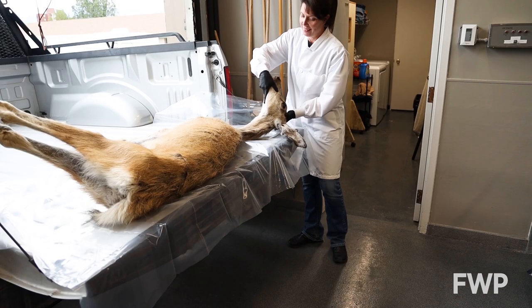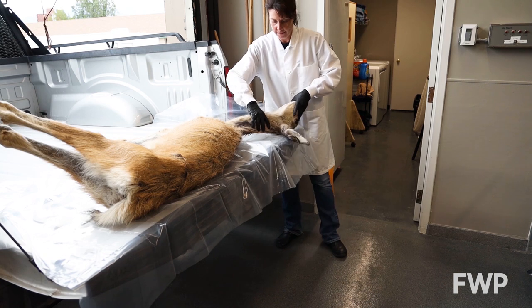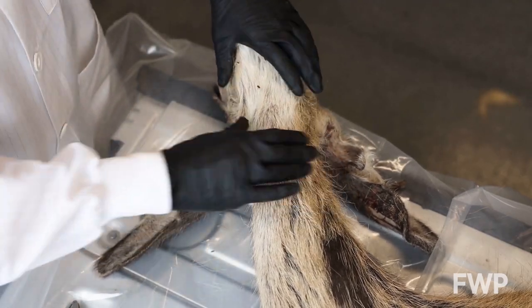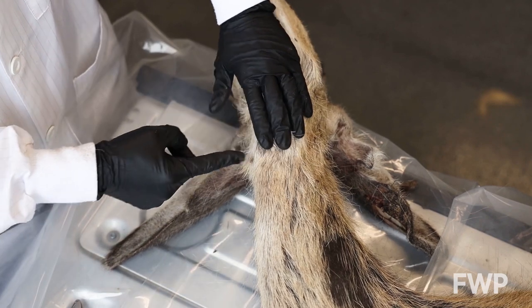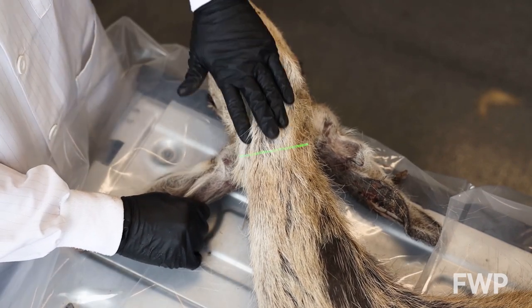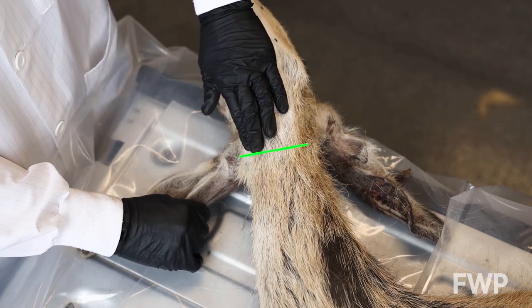Begin by positioning the animal with the head and neck upside down on a tailgate or other workable surface. Next, identify the larynx, or voice box, on the front of the neck. You'll notice a firm edge at the base of the larynx. This is the best location for making an incision.